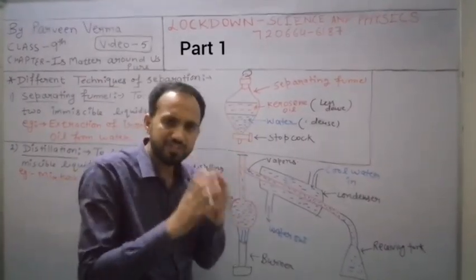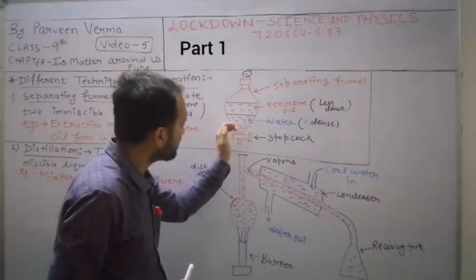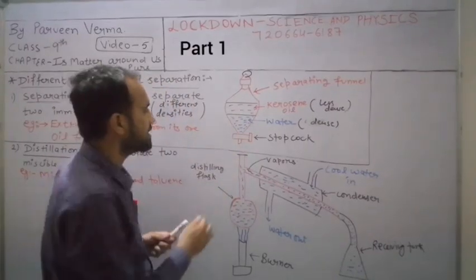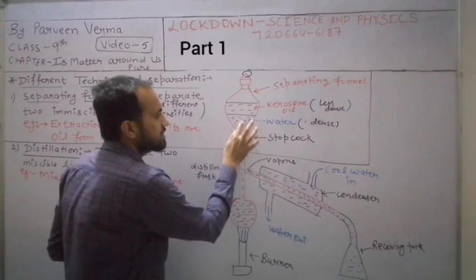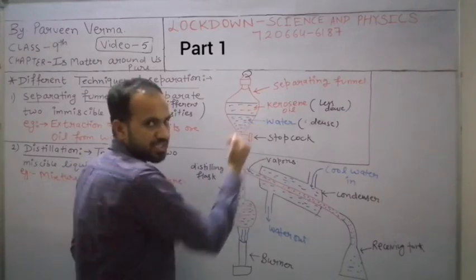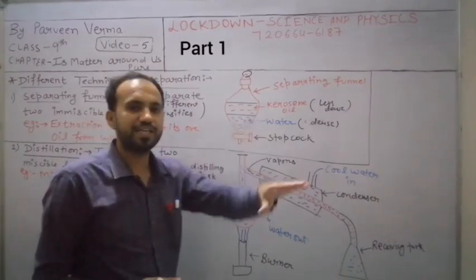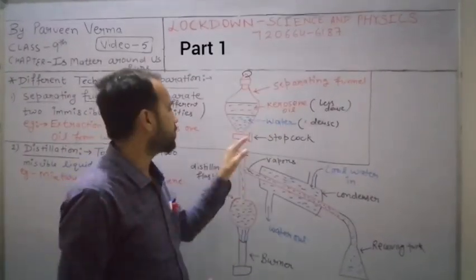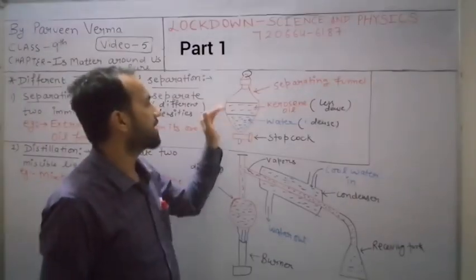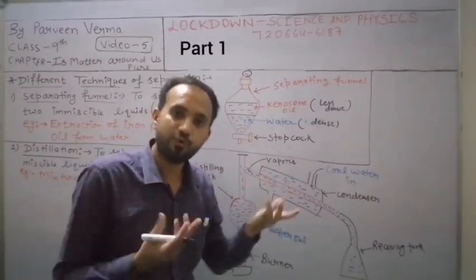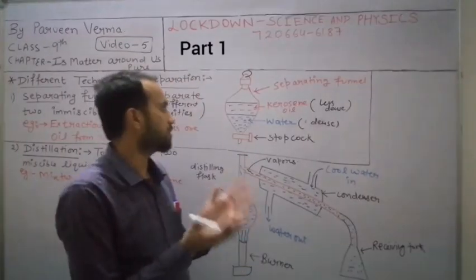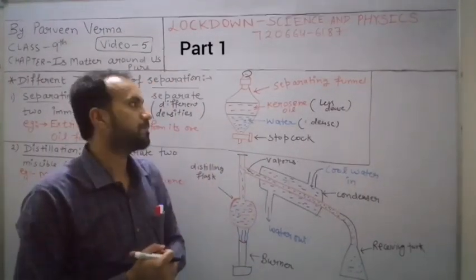Then we will open the stopcock and water will start flowing slowly through the narrow opening. We place a container below to collect the water. As water flows out, the kerosene oil will also move down. Once all the water is collected in the container, we close the stopcock again. Now only oil remains in the separating funnel and water has been separated into the container.